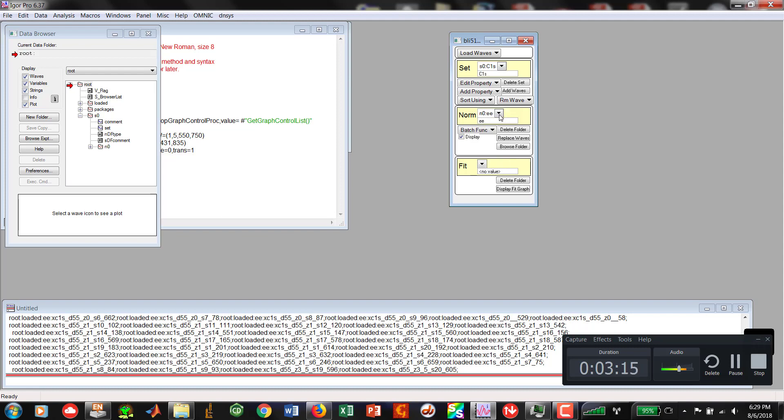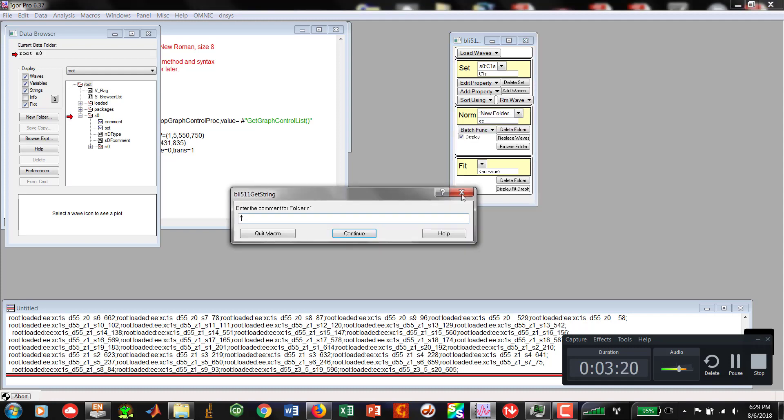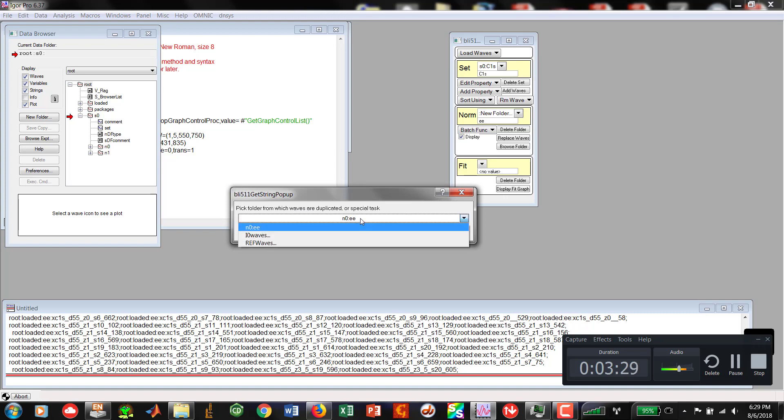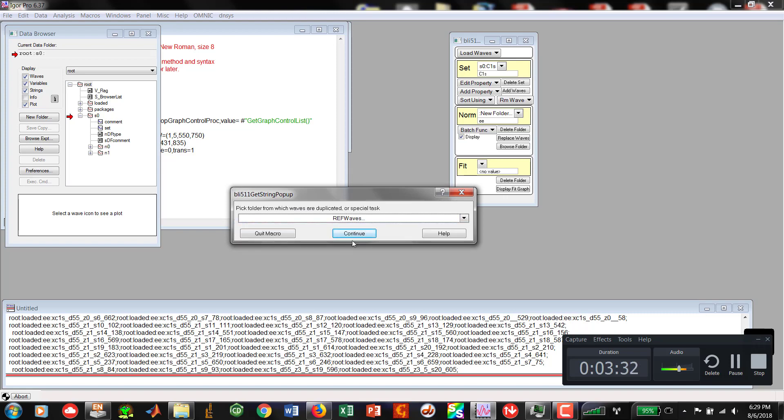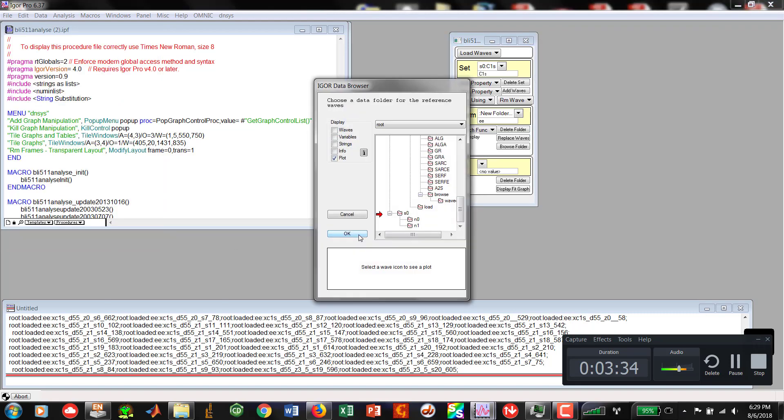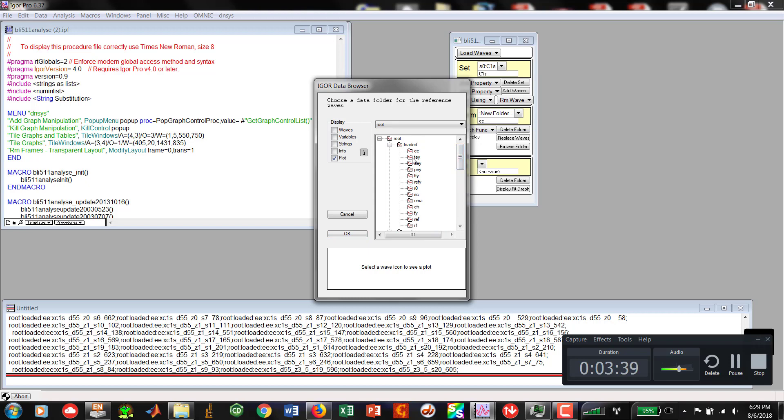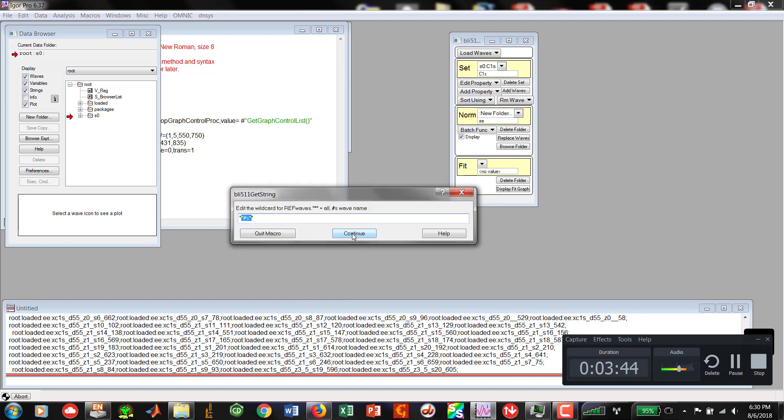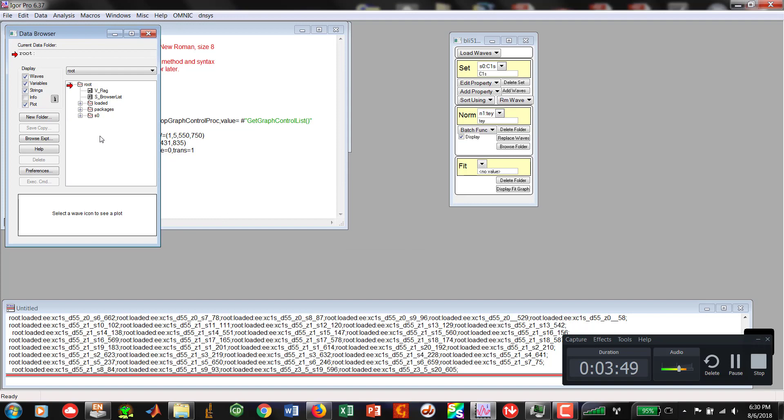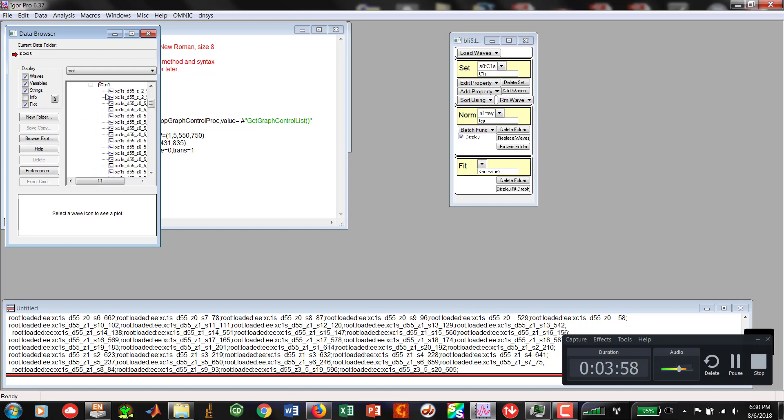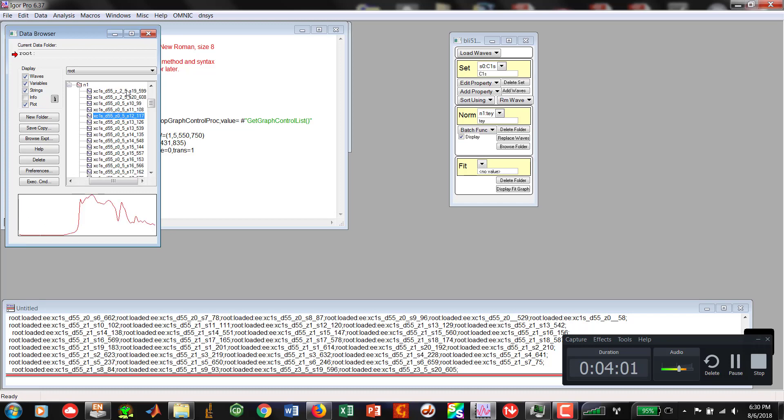And so now we need to bring in the TEY. And this is where I was having some difficulty. So I'm going to make a new folder. I'm going to call it TEY. I'm going to hit Continue. Pick folder from which waves are duplicated. Now go to Reference Waves. Hit Continue. And when you're over here, come all the way back to your TEY. And hit OK. You're going to hit the wildcard. Hit Continue. So now you have two folders. N0 and N1. A little sanity check. Let's go over to N1. Great. It has our TEY data and we are set.